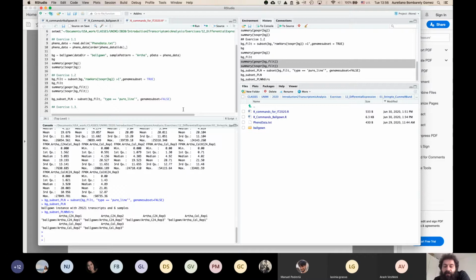So in this case, 1 may not be a good threshold, maybe it should be 0.1. Or if you have too much noise, you may want to increase this to 10. It depends. In this case, I'm using 1 because I think that by default it looks like a good value.